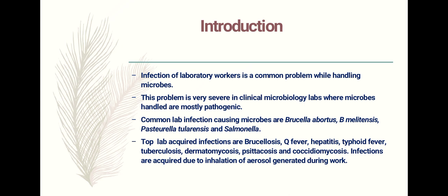The problem is found to be more severe in clinical microbiology labs, because those workers handle more pathogenic cultures. That means they may induce pathogenicity, that is, they cause disease. Common lab infection causing microbes are Brucella abortus, Brucella melitensis, Pasteurella tularensis, and Salmonella.